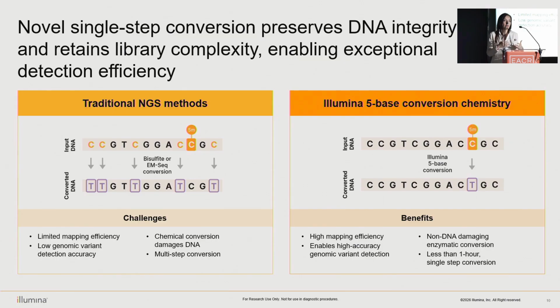Everything that had methylation will be protected, and then all the non-methylated Cs would be converted into Ts. As a result, the methylation component was there, but the library complexity was quite shifted, because you end up with an overrepresentation of Ts. And this has also been quite a harsh treatment that does not preserve the integrity of the molecule.